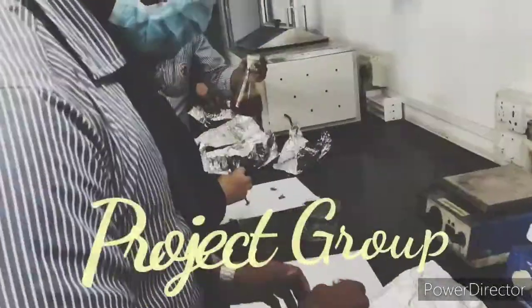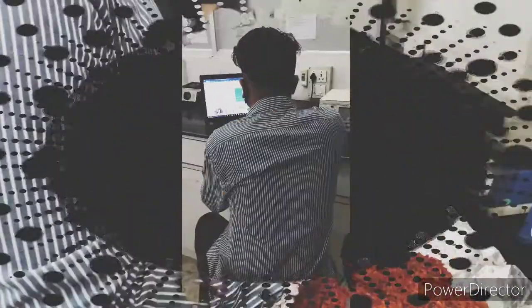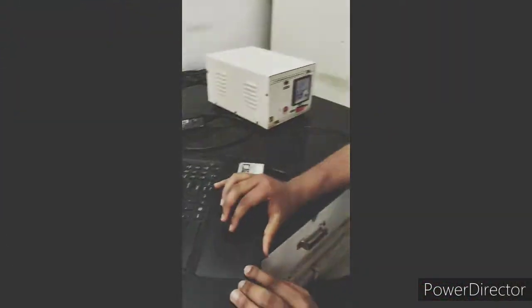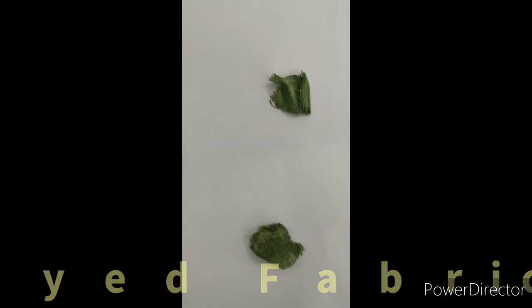We also have our group members performing various assays along with the technical work. Here we have shown the extracted sample of marigold dye and the dyed fabric which has retained its color from the dye.